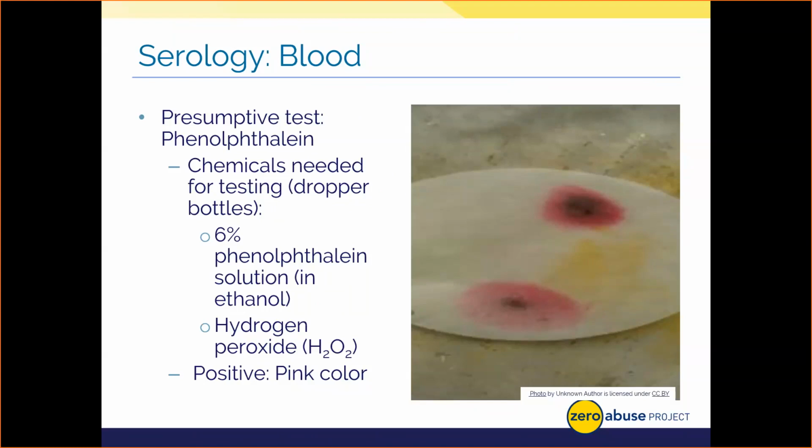But at least in using this particular examination, we'll know if blood is possibly present or not, so we don't waste time looking at a stain that isn't probative for your case. Let's go ahead and talk a little about how this test is performed. The analyst will need a small amount of sample to test. This can be acquired by taking a rubbing of a very concentrated stain using a sterile, that's a DNA or body fluid-free paper. Alternatively, cuttings or scrapings could be used as well.